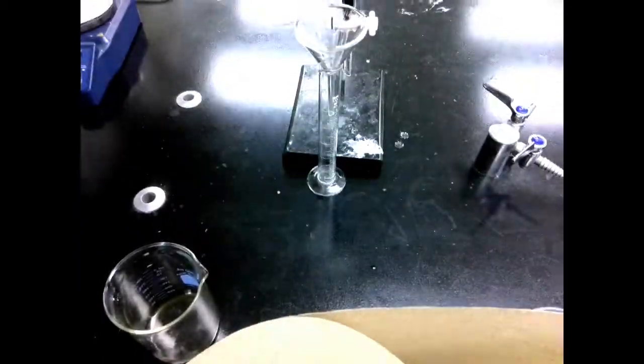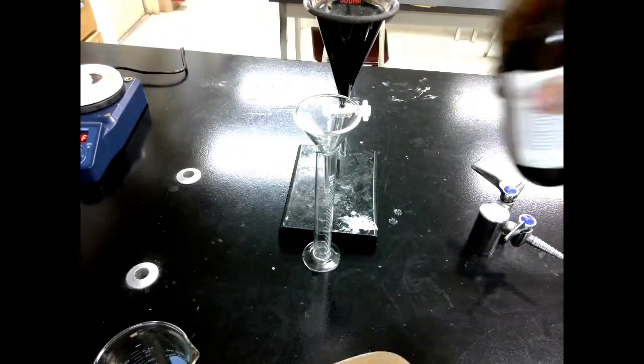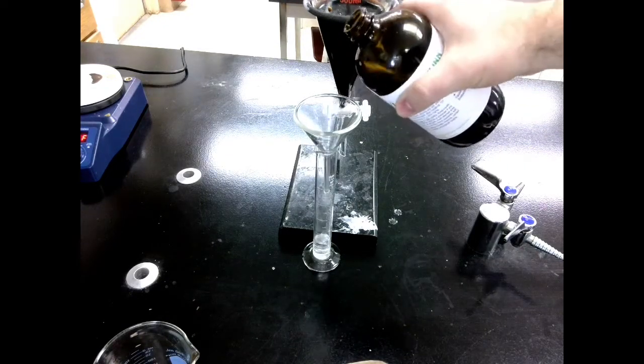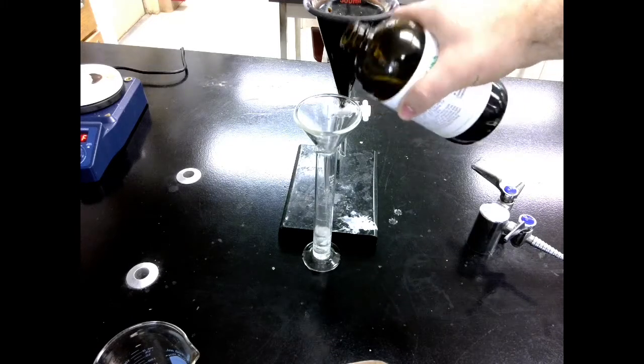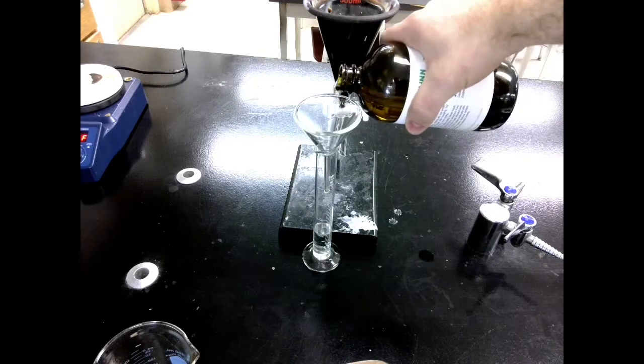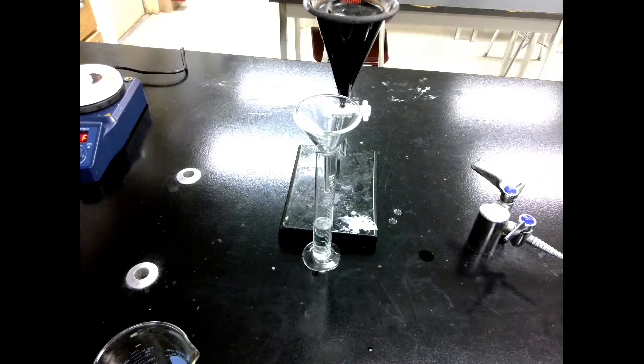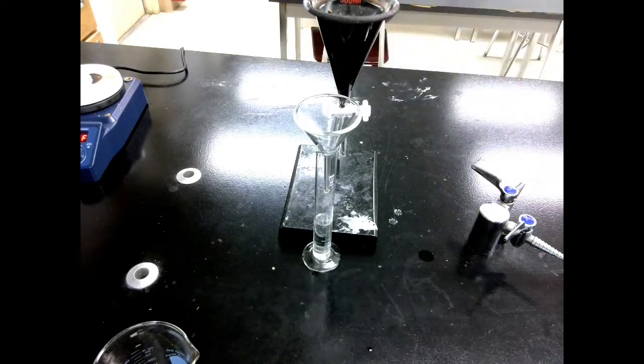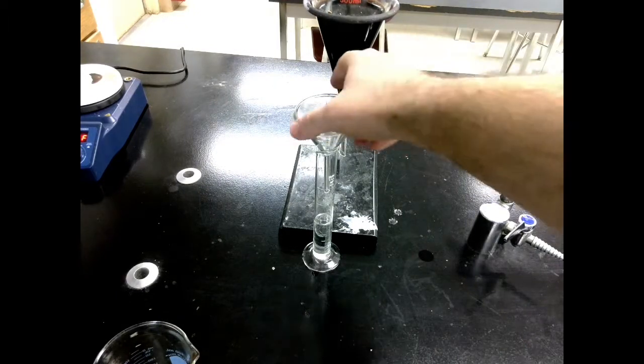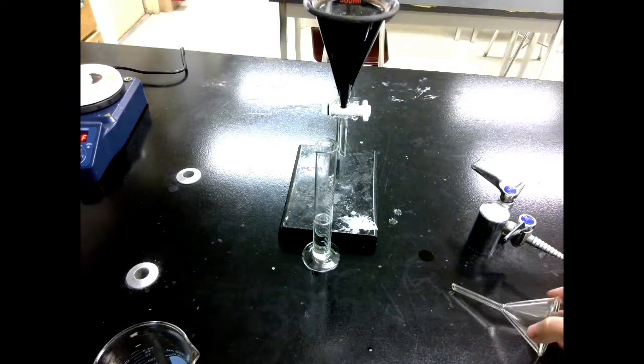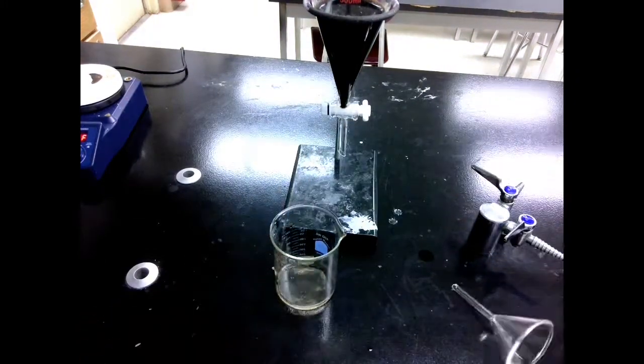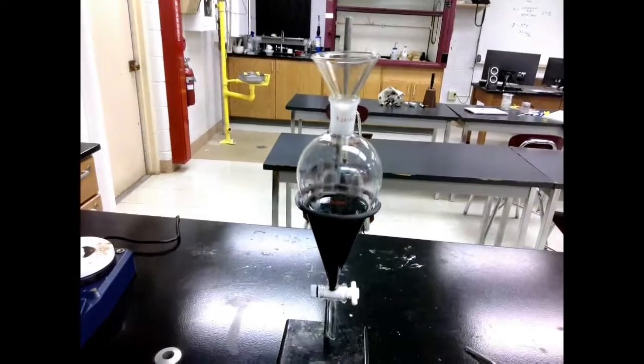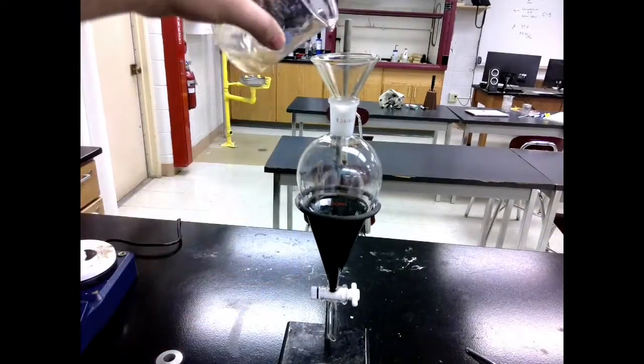Next, we're going to add 25 milliliters of dichloromethane. Use a glass funnel for this because dichloromethane tends to stick to glass, so it won't pour nicely. So it's okay if you get a little bit over. Once you've got your dichloromethane, pour it back into that same beaker that had the tea in it, just to try and get as much out as we can. Then we're going to pour that into the separatory funnel and we'll watch as the layers separate.